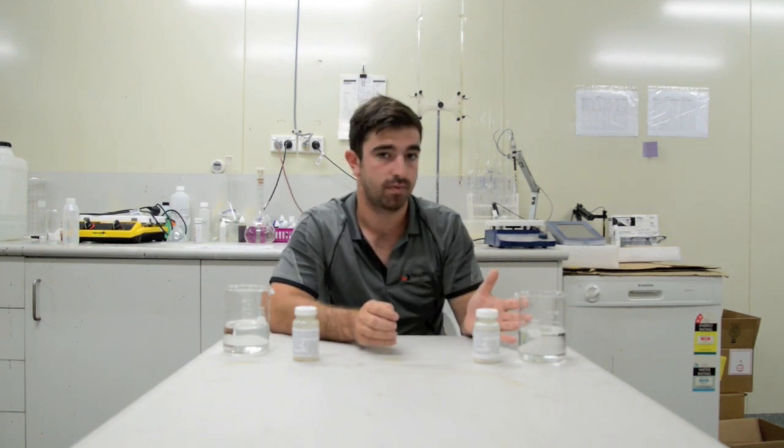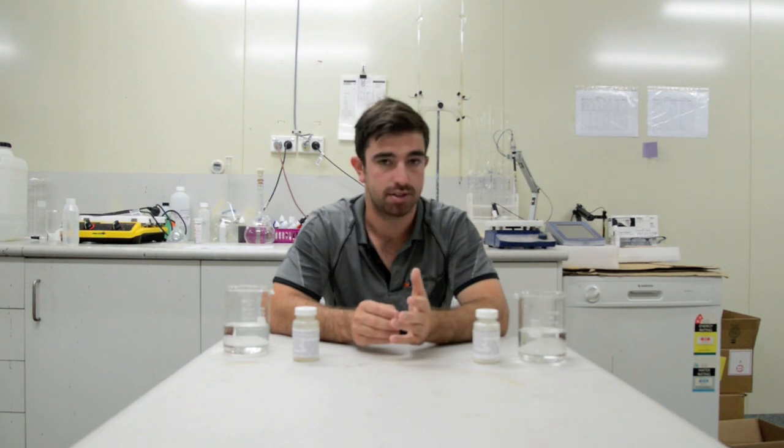Today I have two samples from two different water tanks. They look the same, smell the same, but one has coliform bacteria in it.